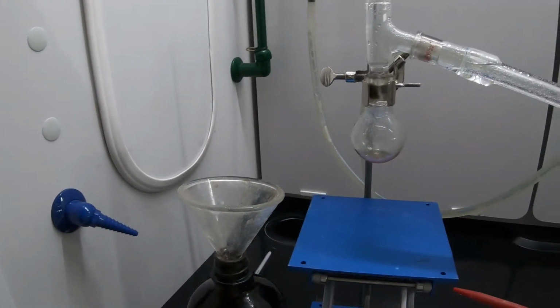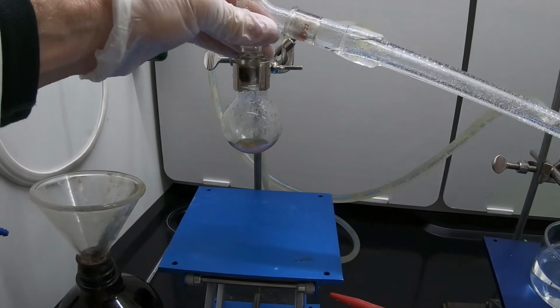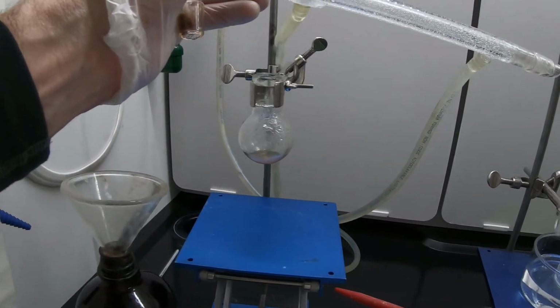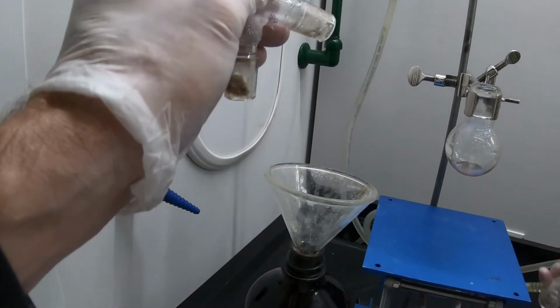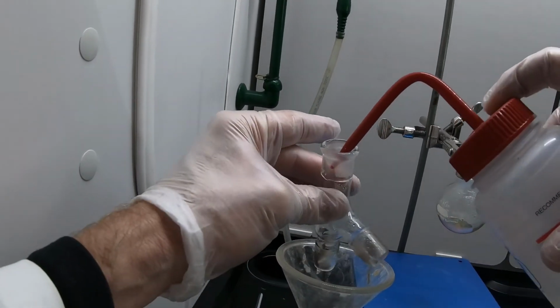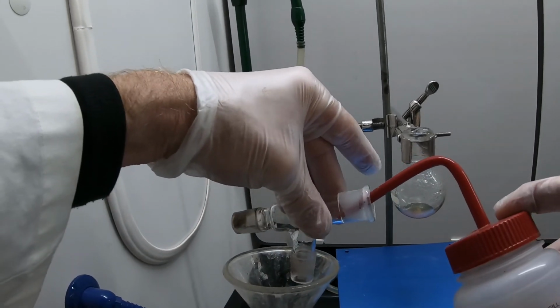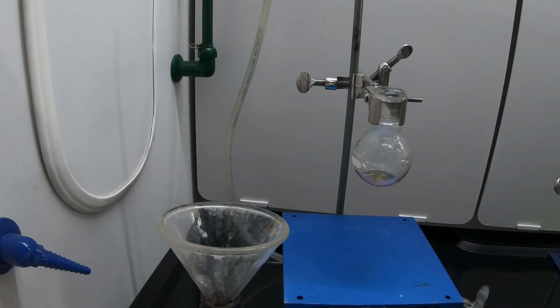All right, I'm going to turn off the water for the condenser and disassemble. And again, please keep in mind that this stuff is fragile and it will break if you drop it. All right, disassembling. Sorry if the camera works a little dodgy. I just want to show you that, yes, absolutely, we can use organic solvents to clean glassware. But again, keeping in mind that this is also now more organic waste, we really want to keep this to a minimum. All right, so I'll continue that later. You don't need to watch this.